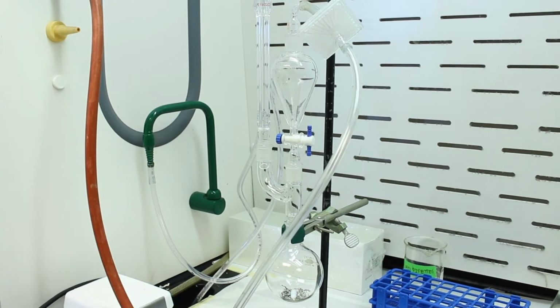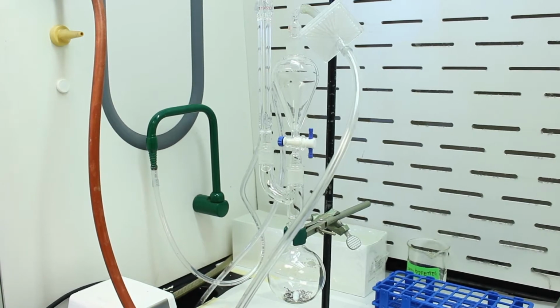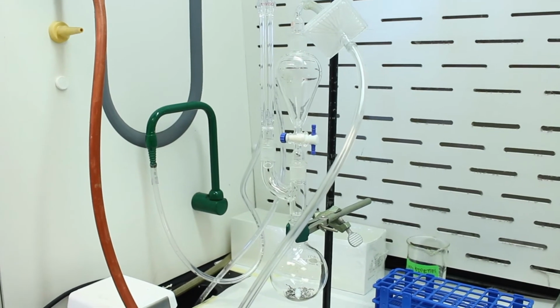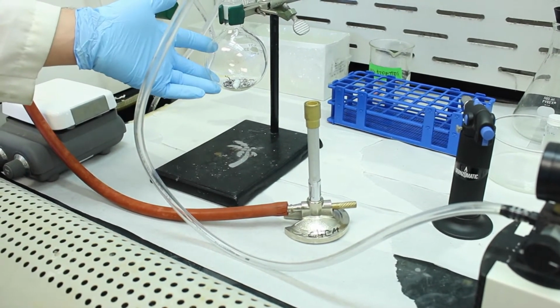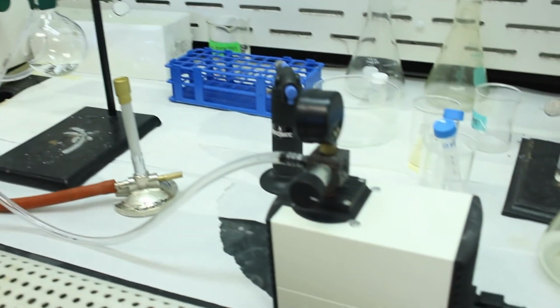Now, this could be done by heating the glassware overnight in an oven, but that's not possible in this case. So what we've elected to do is flame dry the apparatus. We have a Bunsen burner here, and we're going to ignite it and heat the glassware very carefully. At the same time, we're going to pull a vacuum so that will suck all the water vapor out.